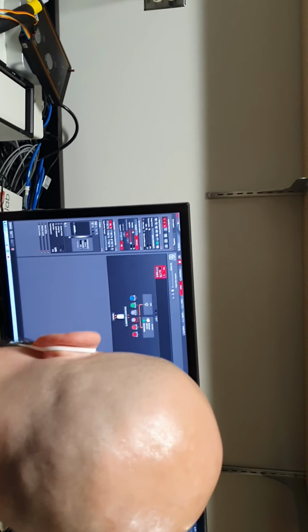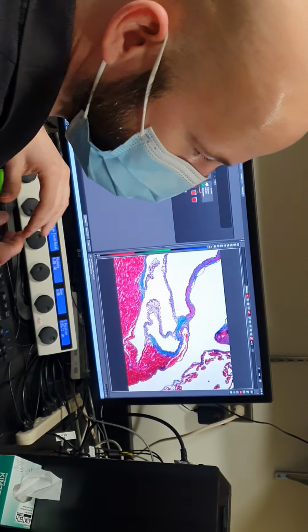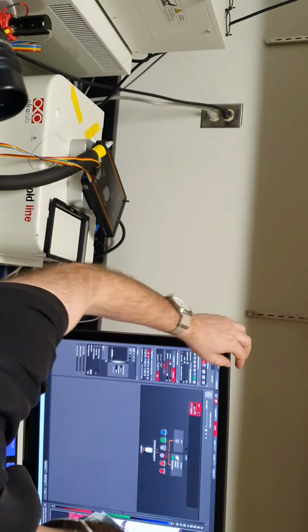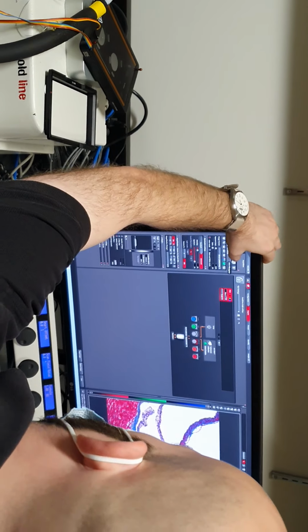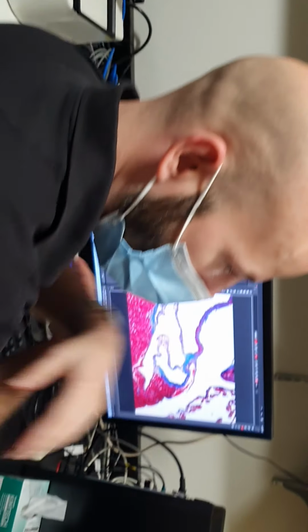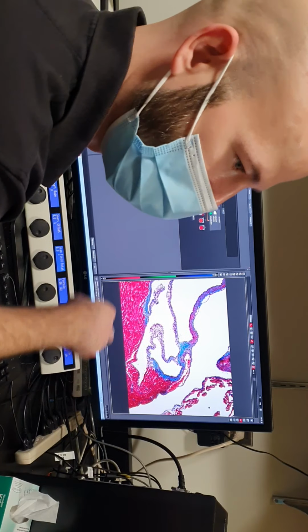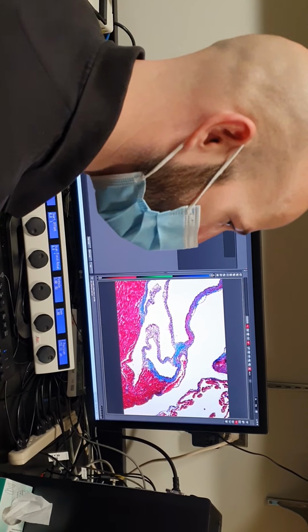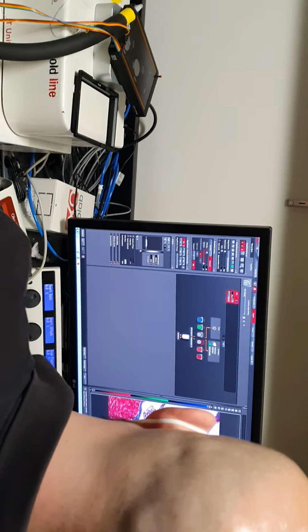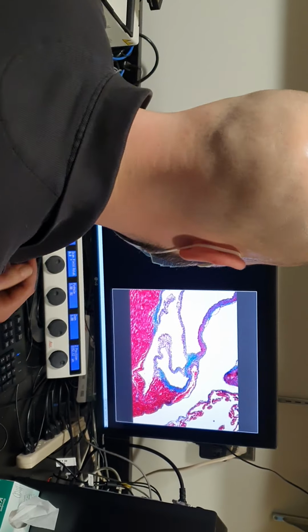And now say, instead of just taking a single image, what about if we want to image multiple fields or image the entire tissue section? So they have a nice feature called Navigator, which basically lets you take sort of overview images and then use the overview images to define the individual fields or regions that then you want to acquire. And it can be in a totally different mode, the overview image versus the actual acquisition.